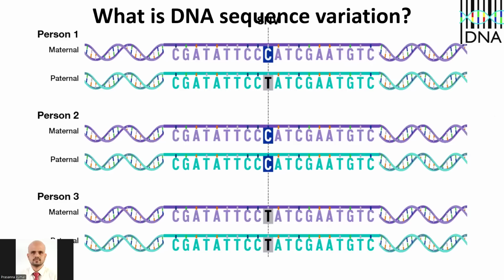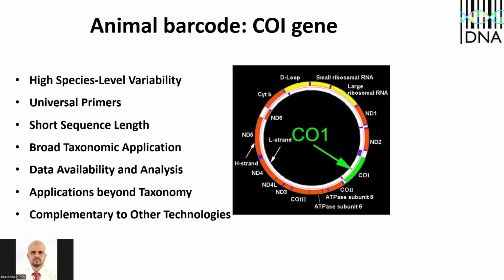For the rbcL and matK genes, 3% is a species cutoff, maybe. It means 97%, 98%, 99%, 100% similarities are allowed within the species. If it is a different species, there will be 95% or 96% similarity, meaning more than 3% variation. So this is what variation means: the intraspecies variation should be low, and between species it should be relatively high.